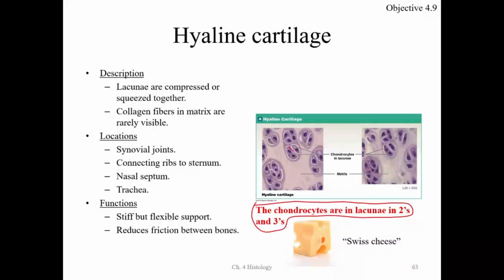Okay? Here is one lacuna and 2 cells. They're the only one that does that, where there can be 2 or even sometimes 3 cells, but at least more than one cell will be in a lacuna. Okay? They're the only ones that do that, where 2 cells are in a lacuna.